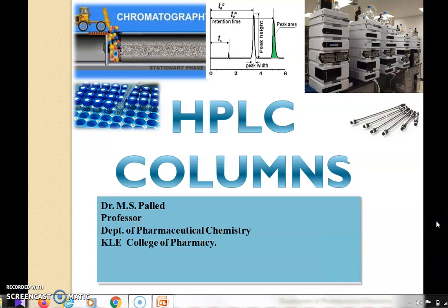Yeah, today I will be discussing the columns. So the column is one of the important parts in the HPLC system, where the separation usually takes place. So it is considered as one of the important parts in the HPLC system.